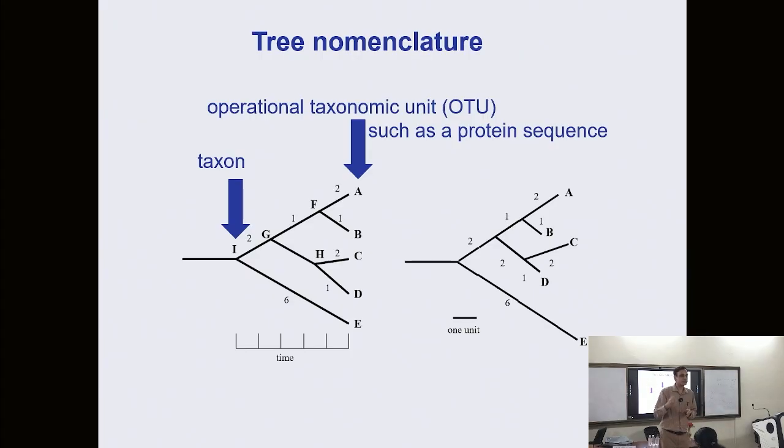So it is possible that that group may have all those species that belong to a genus, or maybe strains that are arising from a species. But I think with this 97% threshold, it does include apparently more divergent organisms by taxonomic classification.